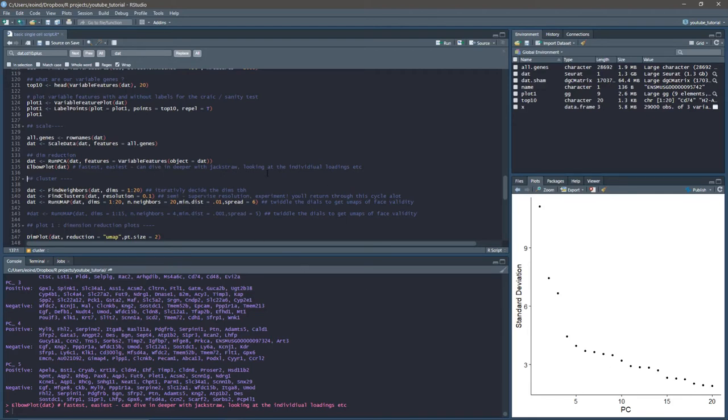So we're now going to take these 20 principal components, and they essentially are summarizing the data. It's a higher level summary of what we're dealing with in terms of gene expression, and we're going to feed that into a clustering algorithm. Seurat's native clustering is a graph-based clustering. The FindNeighbors function is the first step in that, where you construct a k-nearest neighbors graph. I'm going to give it 20 principal components. It's going to generate that graph, and we're then going to use that to identify clusters within that space we've created.